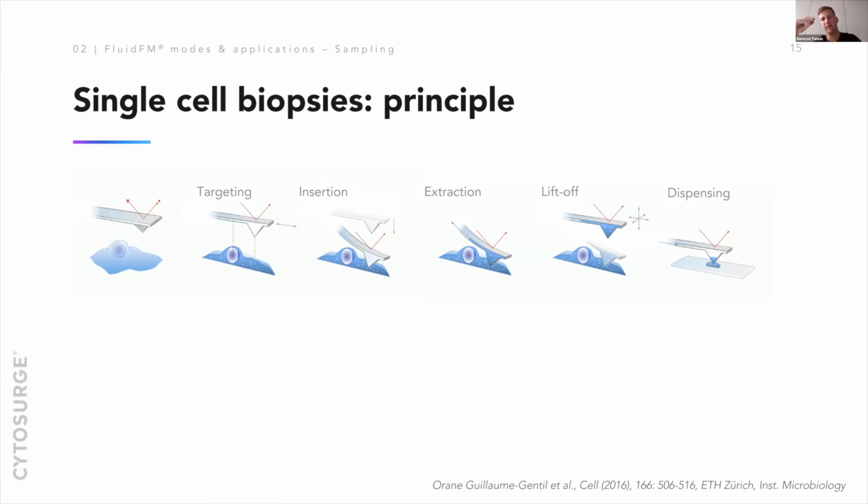Now, before we go into the cell, we would normally pre-fill the cantilever from the front with some amount of buffer, with 1 or 2 picoliters. And behind that, what the cantilever is originally filled with is a mineral oil, which makes sure that when the cell extract enters the cantilever, it doesn't get mixed with anything except for the buffer that we loaded the cantilever with.